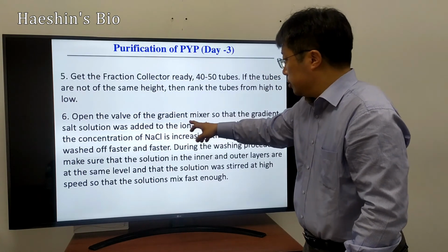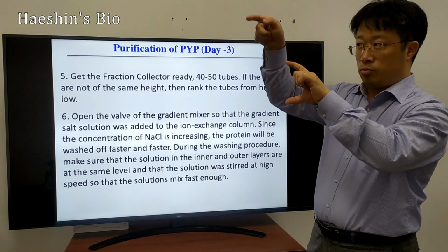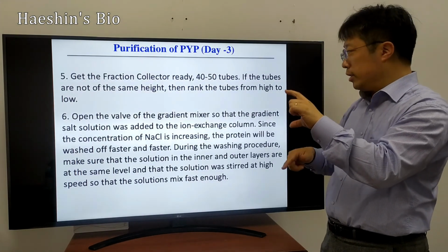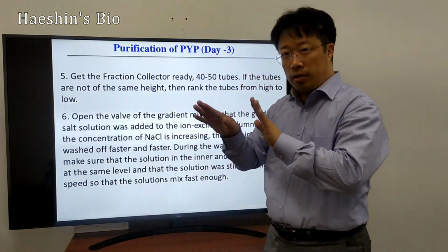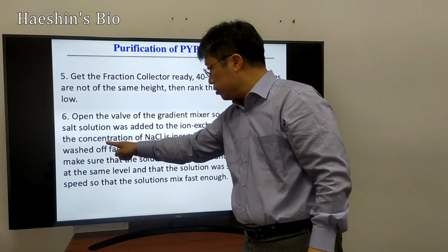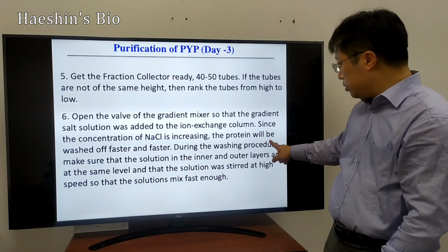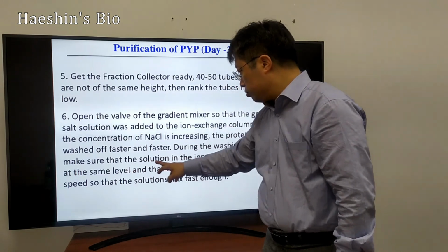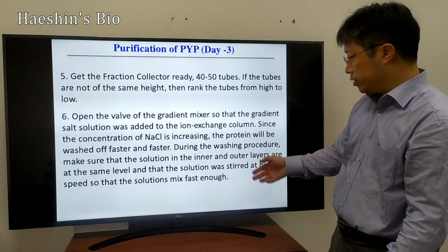To do this, you need the gradient mixer, because you have a column and two lines. One is 0 molar sodium chloride, the other one is high molar, several molar sodium chloride. So you open the gradient mixer, and the two solutions are mixed. Depending on how you open those two lines, you can change the concentration of the sodium chloride. That is basically you increasing the gradient, so the protein will be washed off faster and faster. During the washing procedure, make sure that the solution in the inner and outer layers is at the same level and that the solution is stirred at a high level.